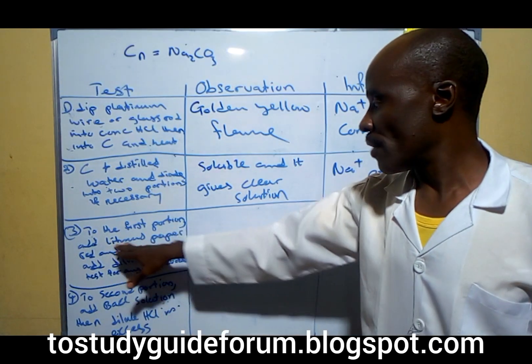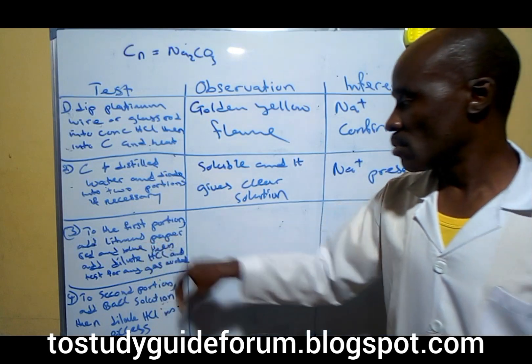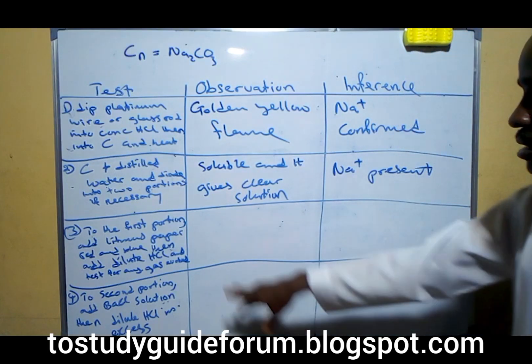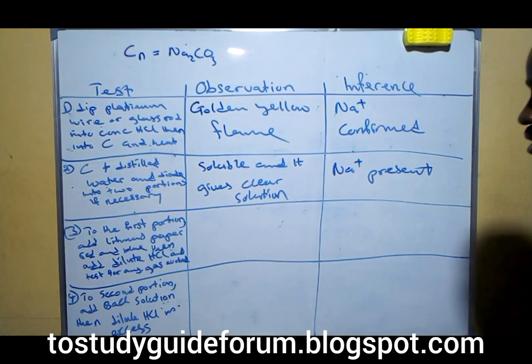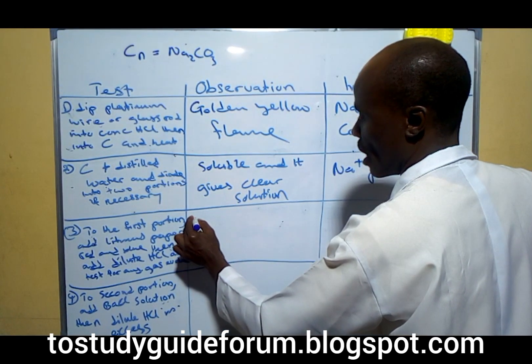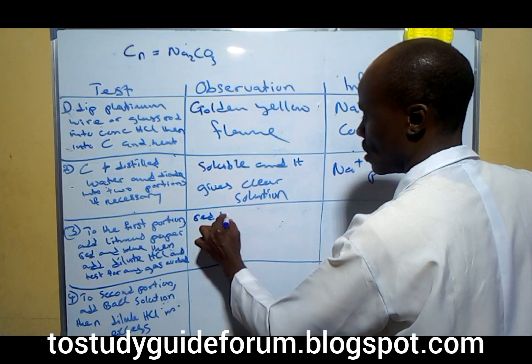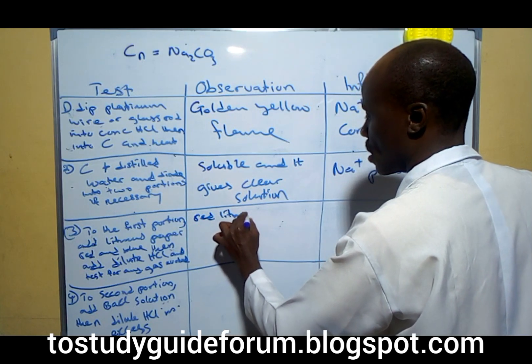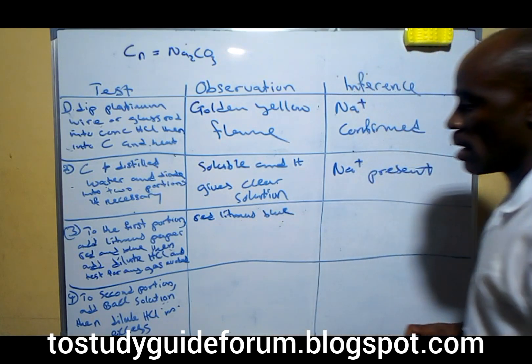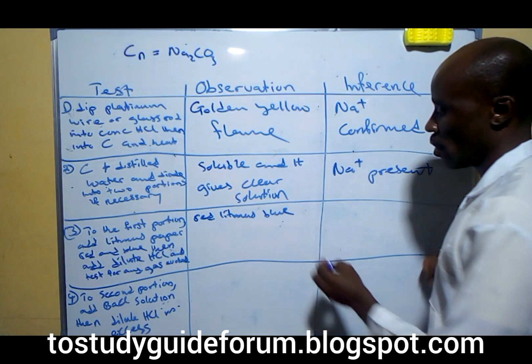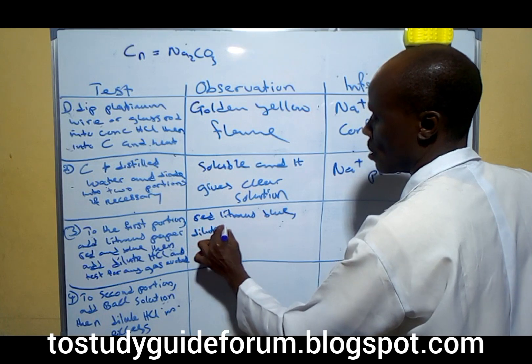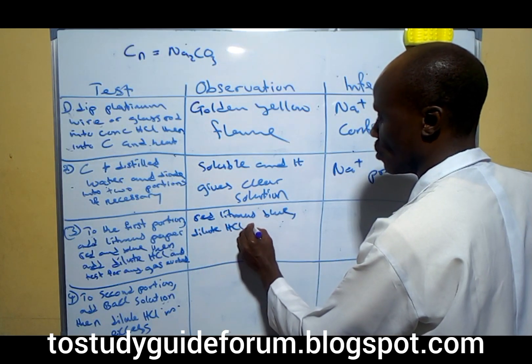To the first portion, add litmus paper — red and blue — then add dilute hydrochloric acid and test for any gas evolved. We add litmus paper and it turns red. On addition of dilute hydrochloric acid, we notice an evolution of gas.